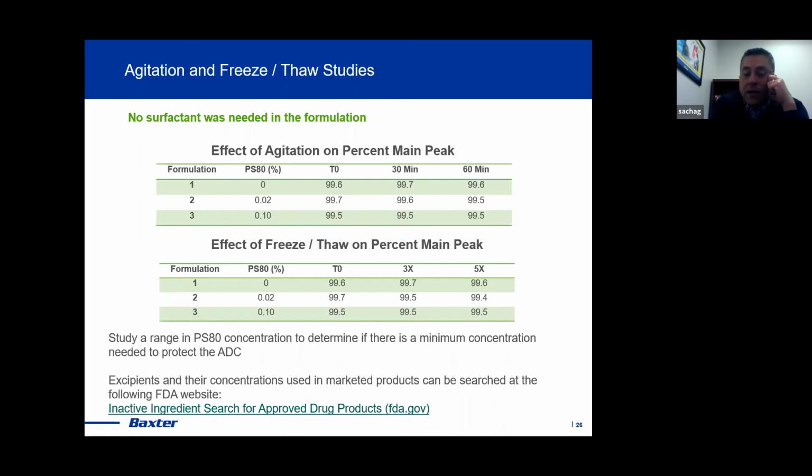Polysorbate degrading is a challenge, because when they degrade, yes, they could form peroxides. They can even form peroxides in the bottle that you receive them in. So if you follow the manufacturer's instructions, especially Croda, they have specific instructions for how to store after you open the vial, because they're highly refined versions of polysorbate 80 that do degrade. And so the storage conditions matter. And part of that storage condition is making sure there's a nice overlay of nitrogen in the vial that doesn't disappear over time. So with the concentrations of polysorbate that we actually use in the formulation, I don't think I can name a time when I've seen a protein or a monoclonal antibody degrade as a result of polysorbate being present. But it's a good question.